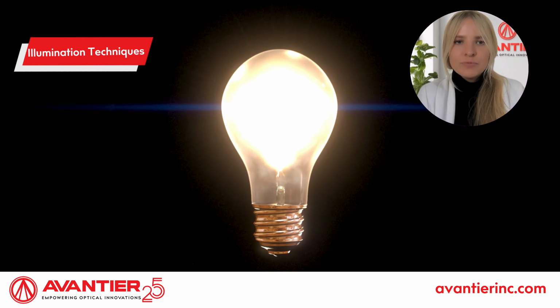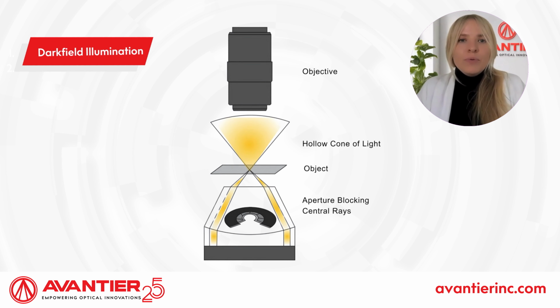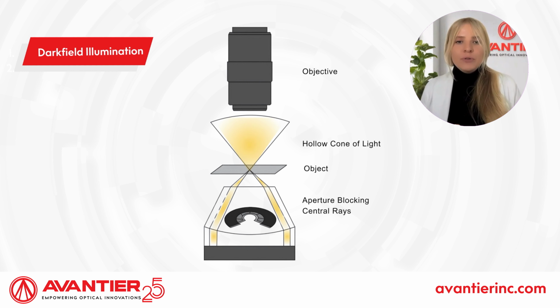Speaking of illumination, let's explore 3 common methods. 1. Bright field illumination backlights the sample for clear observation of structural details. Most effective for specimens with opacity variations. Less suitable for highly transparent objects. 2. Dark field illumination directs light obliquely, making the sample appear bright against a dark background, enhancing contrast. Ideal for observing transparent or unstained specimens that lack sufficient contrast in bright field illumination.